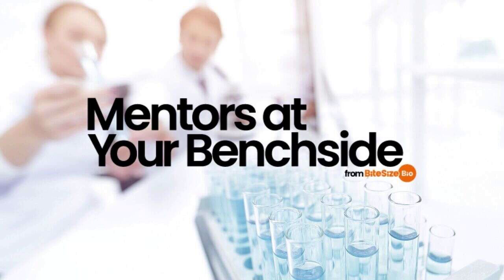Are you using a low copy number plasmid? Use double the recommended volumes of resuspension, lysis, and neutralization buffers. This might also help for high copy plasmids that have given low yields or poor lysis in the past. After adding the lysis buffer, instead of the 4 to 6 inversions recommended in the protocols, gently mix by inverting the tube continuously for 3 minutes. Then, immediately add the neutralization buffer. Mix the neutralization buffer by gently inverting continuously for 1 minute.